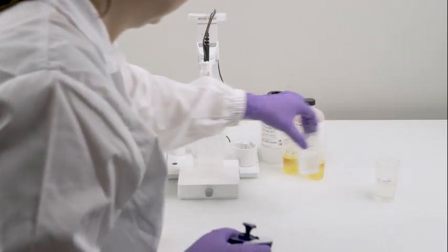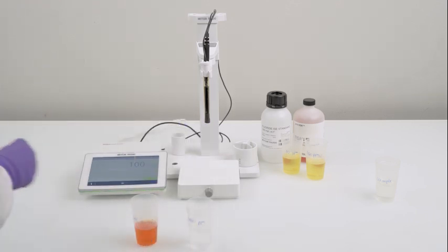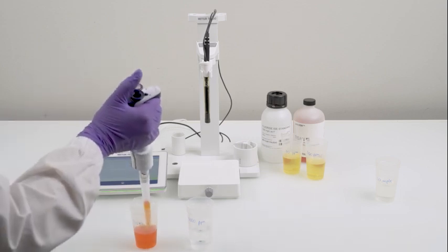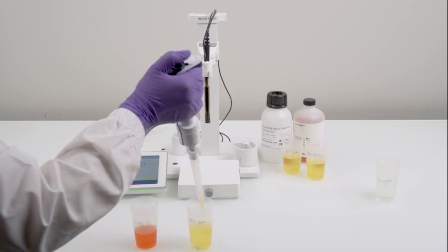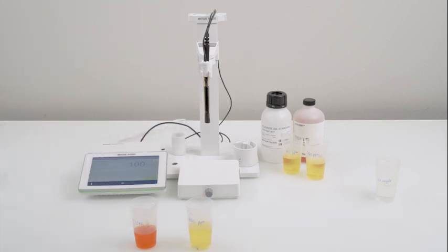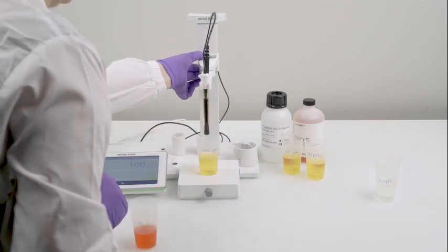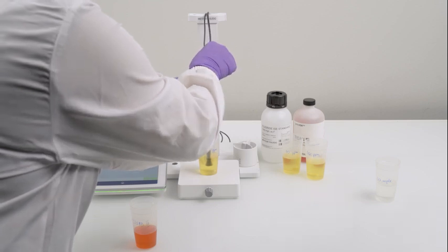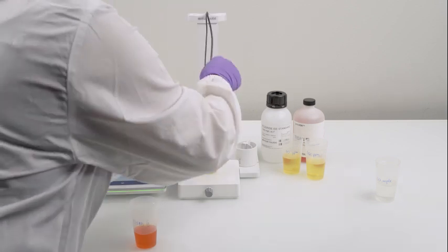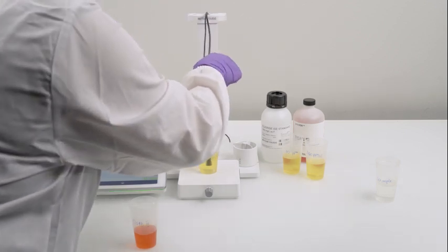Repeat the process with the beaker filled with 1000 ppm standard. Add the stirring bar and the necessary amount of ISA solution. Immerse the sensor and temperature probe. Press read to calibrate.